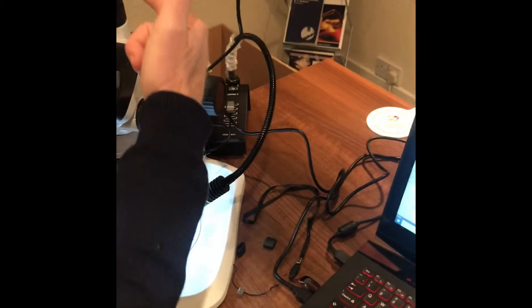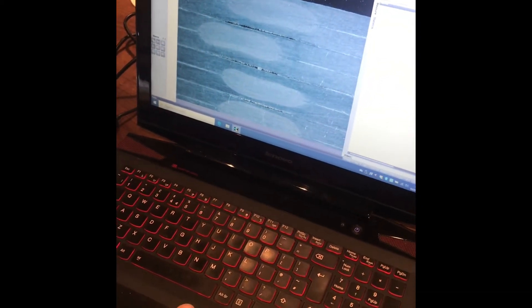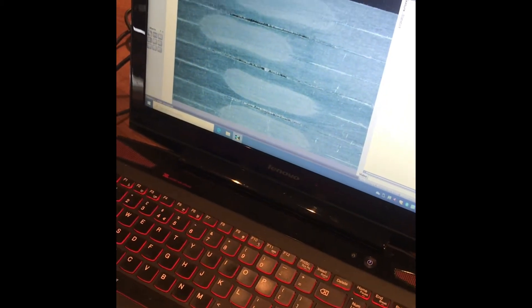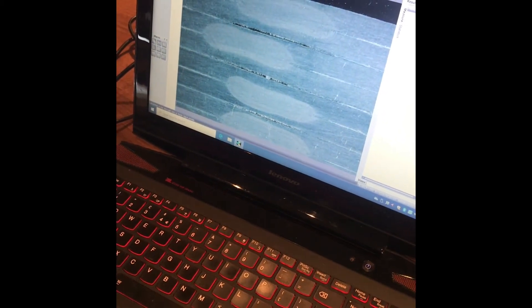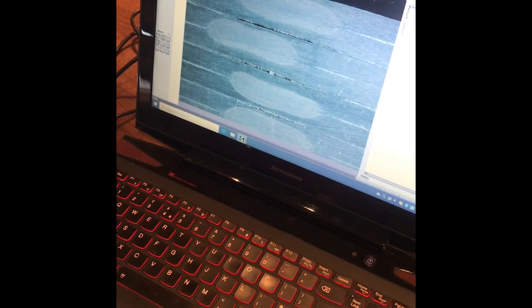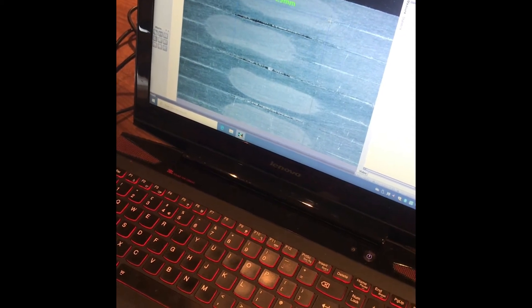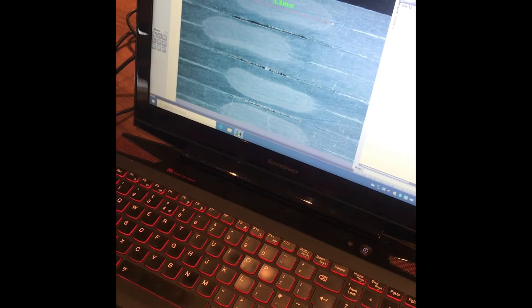But we're going through the camera so we can see the spot welds on the screen. Now we're calibrated and what I'm going to do is select the measurement function and just measure each of these features as requested by our customer.